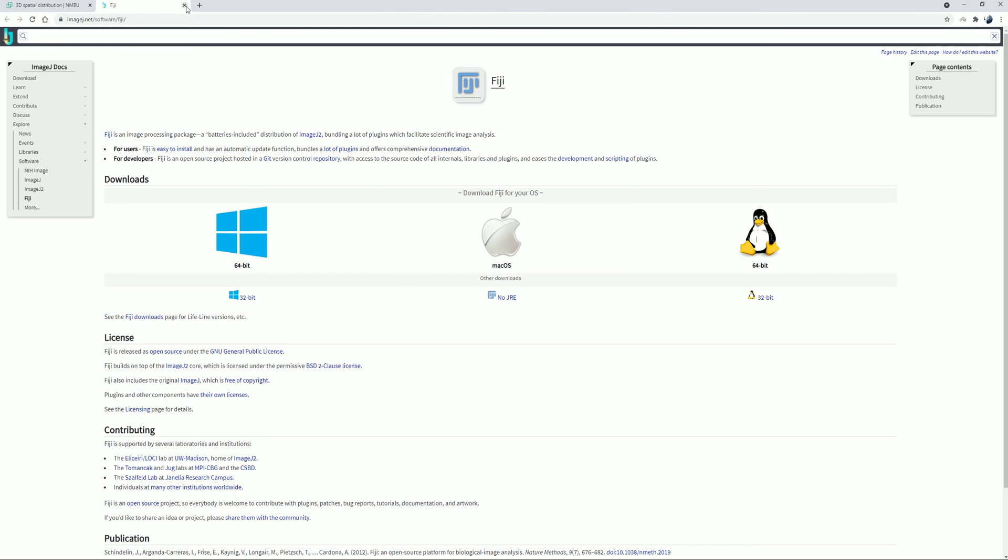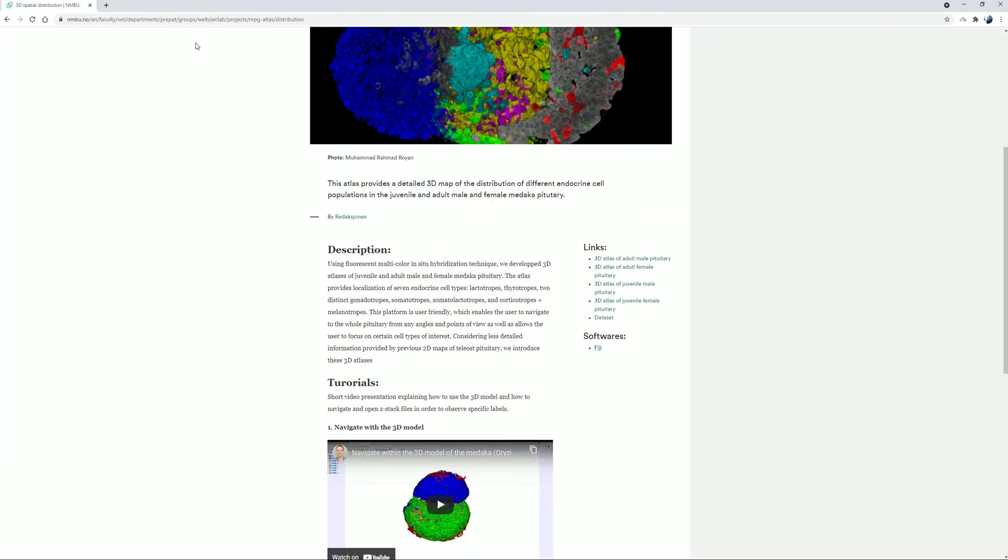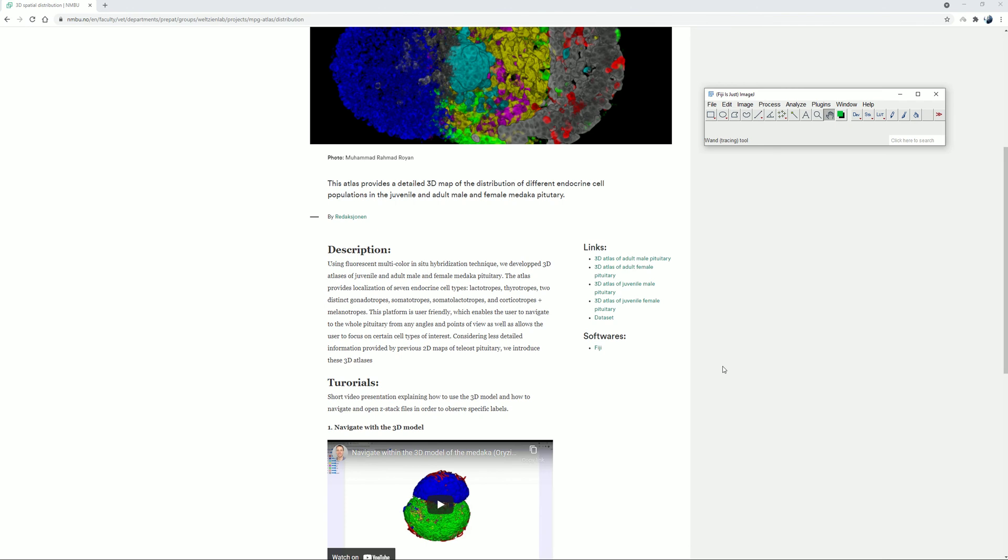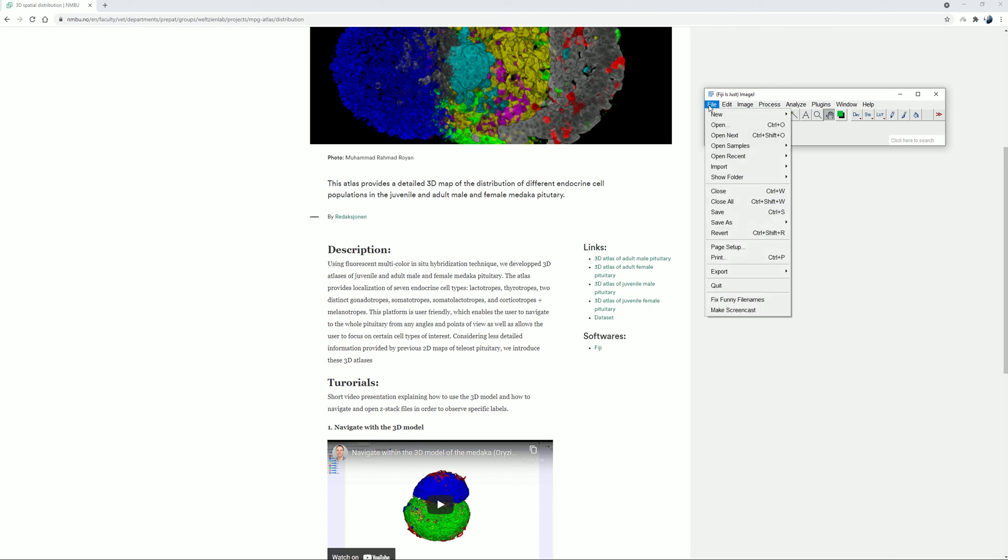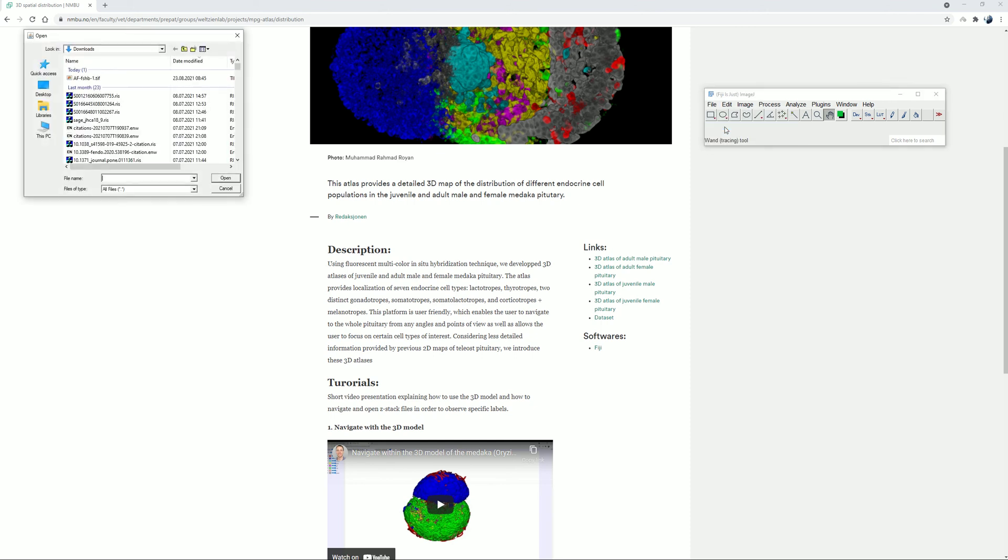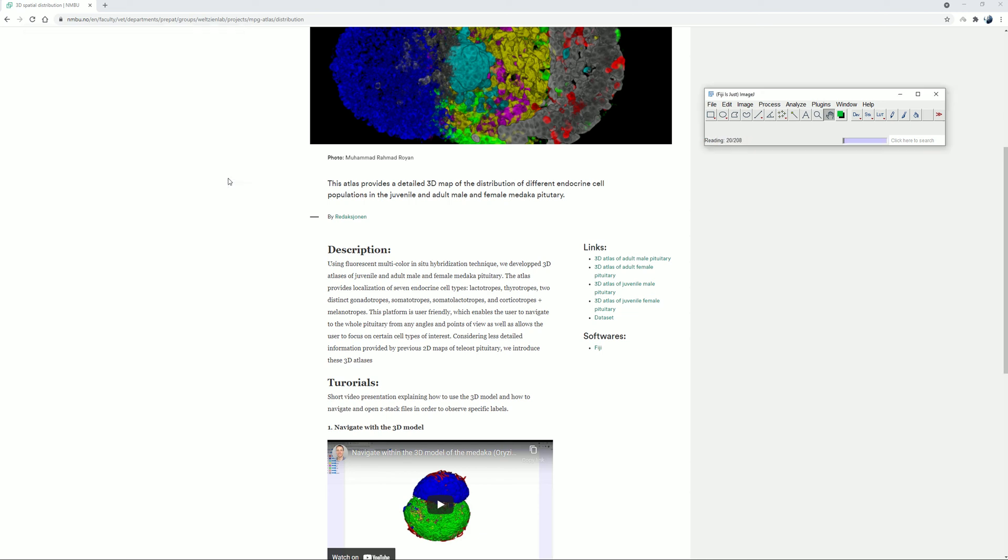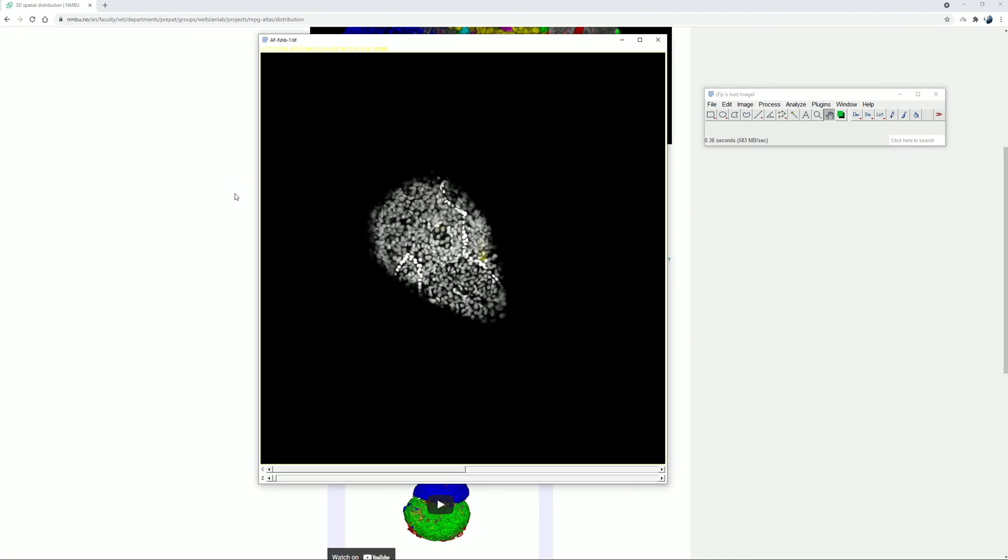Now, assuming that we have installed the software, simply open the software. Open the data file that we have previously downloaded by clicking menu file. Select open and browse through the file directory folder. Select the file and then click open. Alternatively, we can just drag and drop the file into the software.